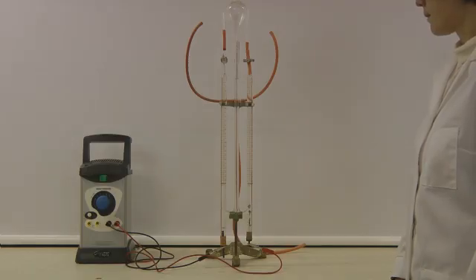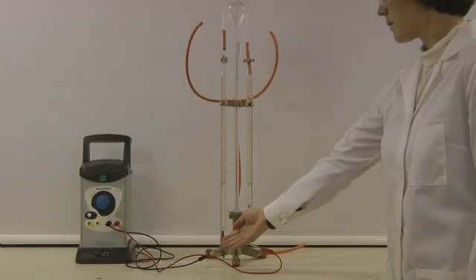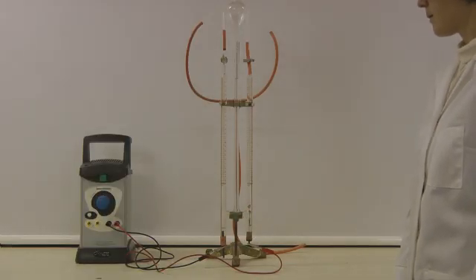At the bottom of the apparatus there are two electrodes, the positive electrode and the negative electrode. These are connected to a power supply.